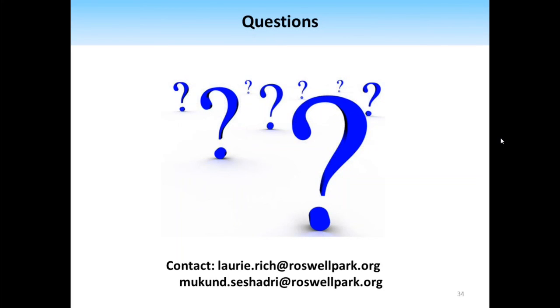That's a great question. That might be one that Dr. Seshadri would actually be able to answer if you're interested in asking him. But we are definitely aware that there are some other effects, so the gas inhalation is not just changing oxygenation in the blood, but could be changing blood flow. So those are definitely things that need to be accounted for.